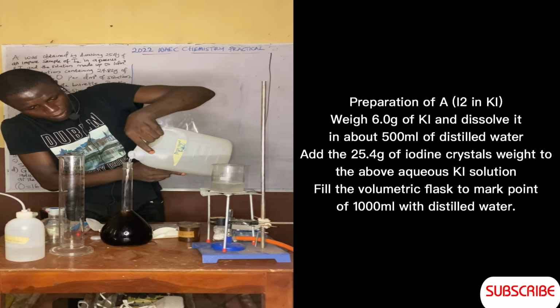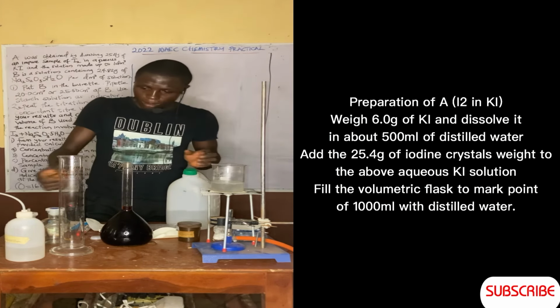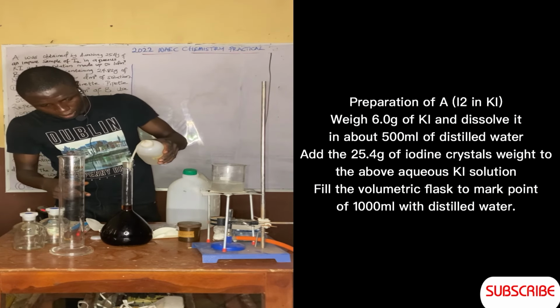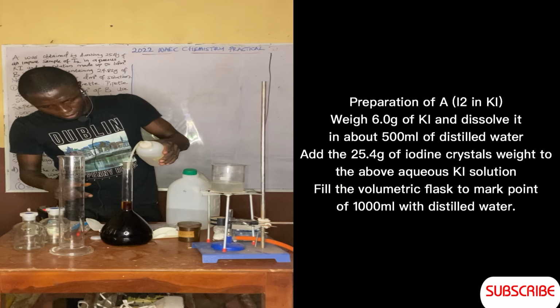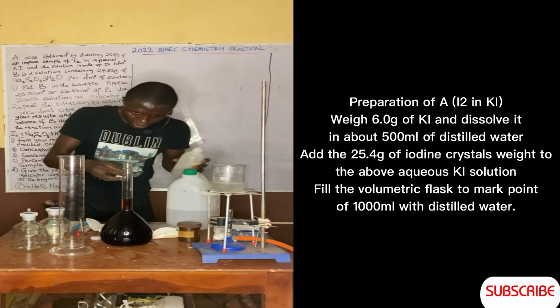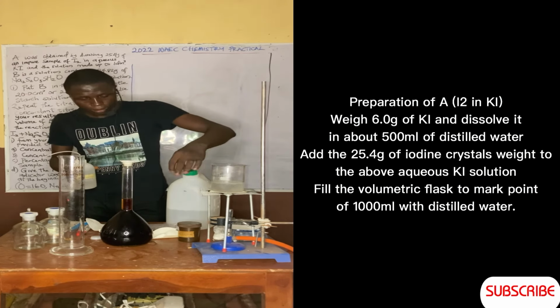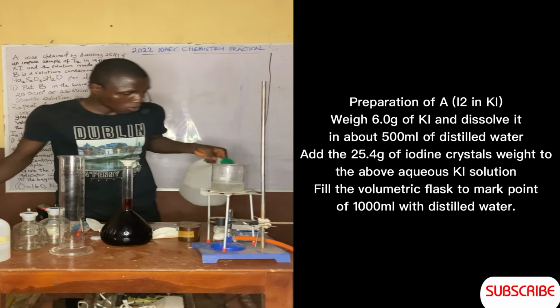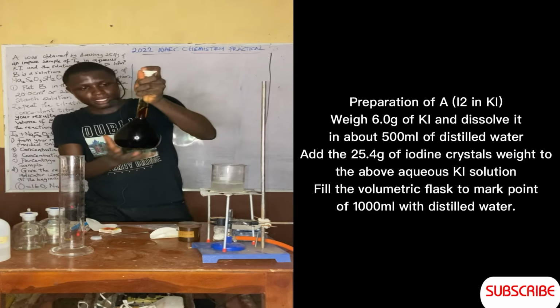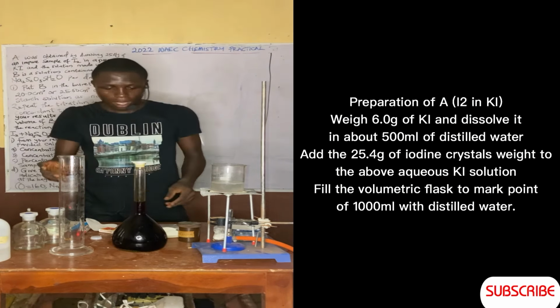So you're almost there. We're exactly there already. So that's that about iodine. So we have prepared the two reagents now. This is iodine here. Is it up to the mark? Yes. So that's that about your iodine.